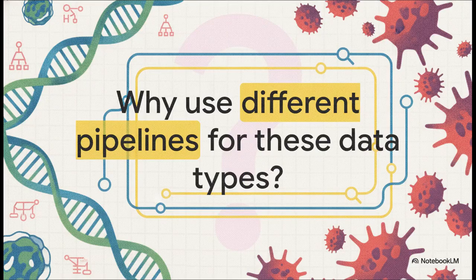Now, you might be wondering, DNA is just DNA, right? So why in the world do germline and somatic data need completely different pipelines? It's a great question. Well, when we actually look closely at the steps for processing and verifying data in these two very different clinical contexts, we realize they require totally different computational and physical approaches. We really can't just use a one-size-fits-all method here, mostly because the fundamental biology we're looking at, inherited traits versus acquired cancer mutations, well, it changes the math entirely.